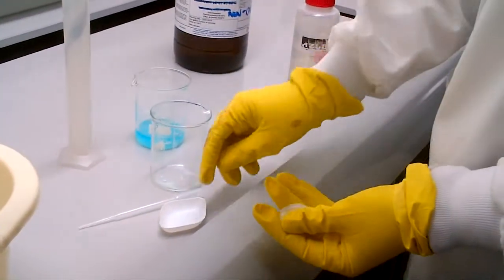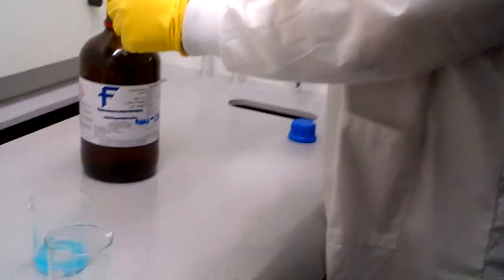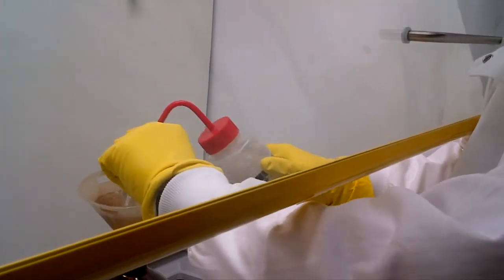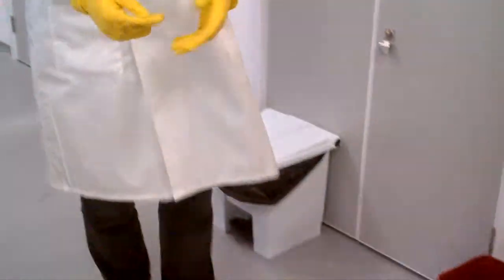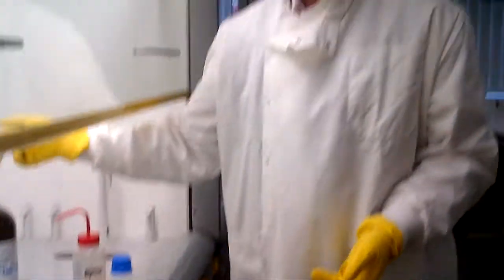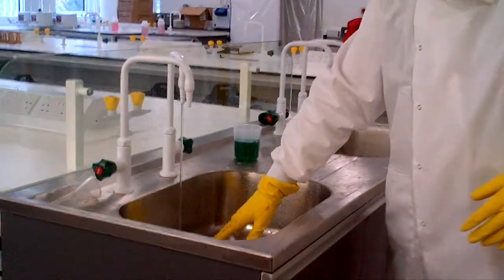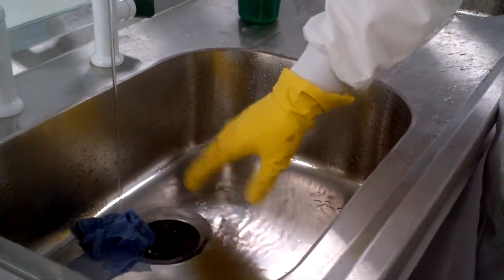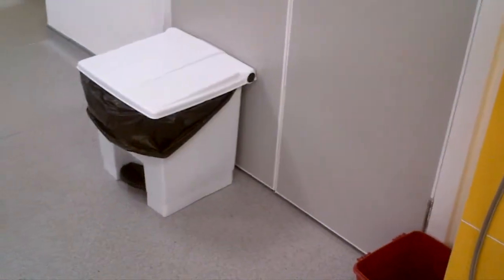Let's, for example, say you've got filter papers, pH papers, weighing boats, Pasteur pipettes. If it's a Pasteur pipette and you feel it's got anything organic in, you might need to wash the inside of it, clean it that way. If it's a glass pipette, clean it. It's organic. This goes into the purple waste bin. Likewise, if you've been using glass pipettes and there's organic residue, go towards the glass bin. If you've been using glass pipettes, plastic pipettes and you've got concentrated acids in, you would then need to come towards the sink area. With the plug in, a quantity of water in the bottom, drop into the water if it's concentrated acid, concentrated hydroxide. Let it wash that way and then you're going towards one of the two bins. Glass bin, waste paper bin.